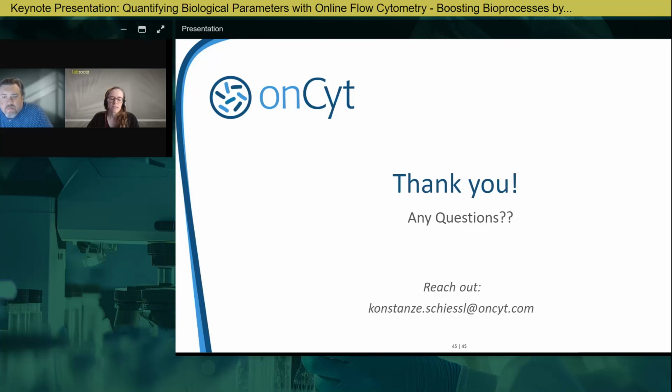Of course, there are always size limits. There's a maximum size of cell that will no longer fit into a flow cytometer, and that depends a bit on the setup. I'd say 50 to 100 micrometers is probably the upper limit. And then there are also lower limits, where it's really hard to measure super small particles. But we've measured, I think, down to 0.5 micrometers.